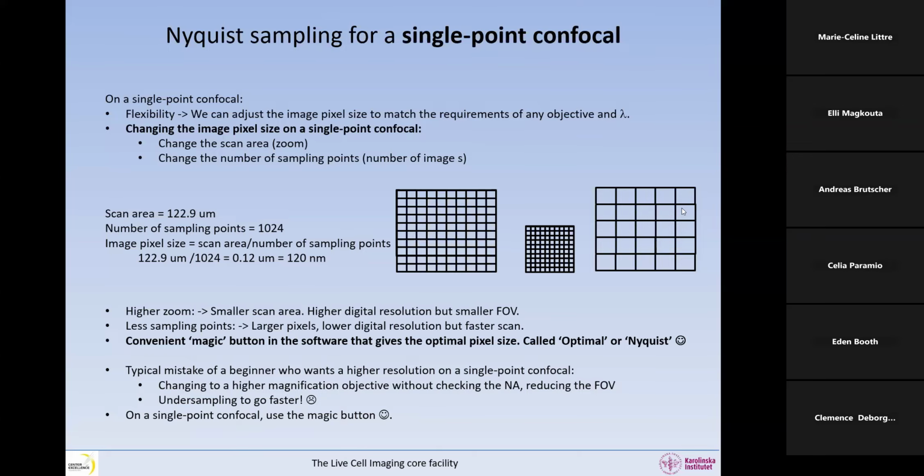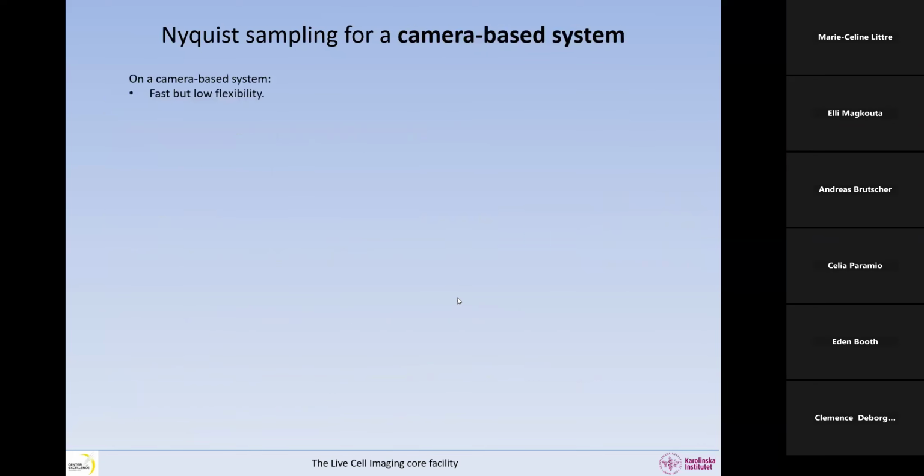And we will talk again about what am I doing with this image? Do I need to have this resolution or not? It depends on if you can extract a reliable answer to your scientific question.